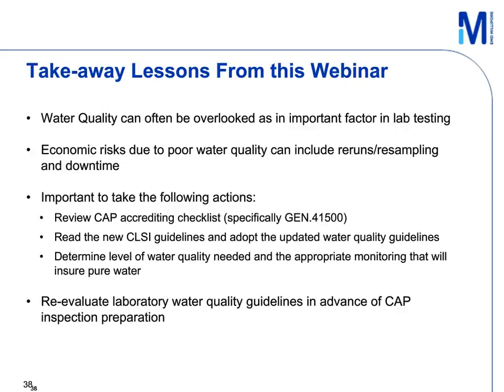So what are the takeaways? Water impacts clinical assays in many ways. In the clinical laboratory, a good practice is to consider water as a critical reagent. Therefore, care should be given to the quality of the water required to run various assays in the laboratory and to water handling in general. Designing, selecting, and maintaining water purification units in a suitable manner can reduce issues linked to water quality and clinical assays, instrument downtime.